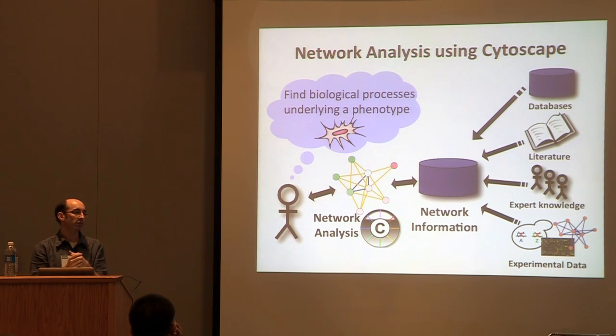That's great. Often people have a list of genes that they're interested in, and they want to do some network analysis starting with a list of genes. In that case, you have to get a network somehow. Maybe you can get a network through correlation analysis. You could also get a network by looking up protein interactions and other types of network information from databases, which I'll mention. And then you can load it into Cytoscape, visualize it, and then there's a bunch of analysis tools.